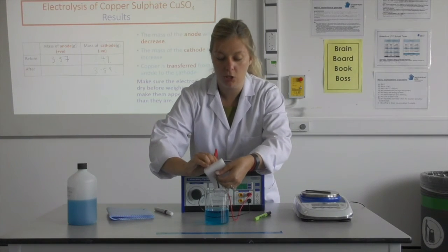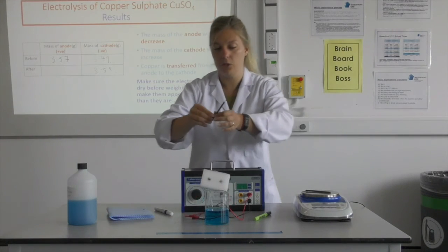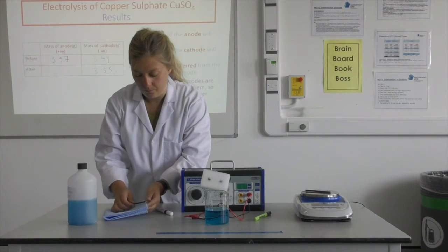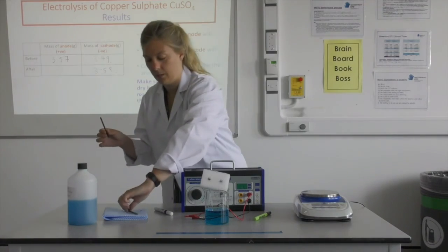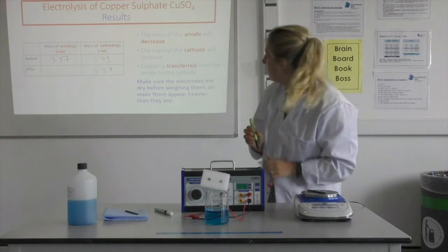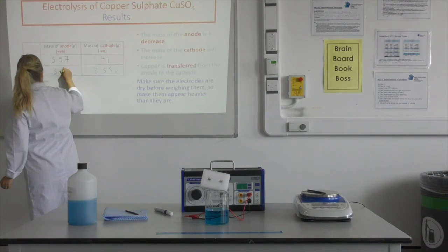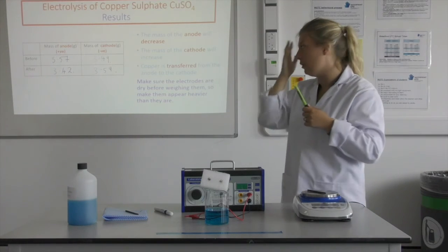We'd expect to have lost mass. Let's hope that we've got a nice result for you today. I'm just going to pat it dry so no liquid affects our results. Let's see, have we lost mass? And it's gone from 3.57 to 3.42. So we have lost mass. So that's a brilliant set of results there for you to see today.